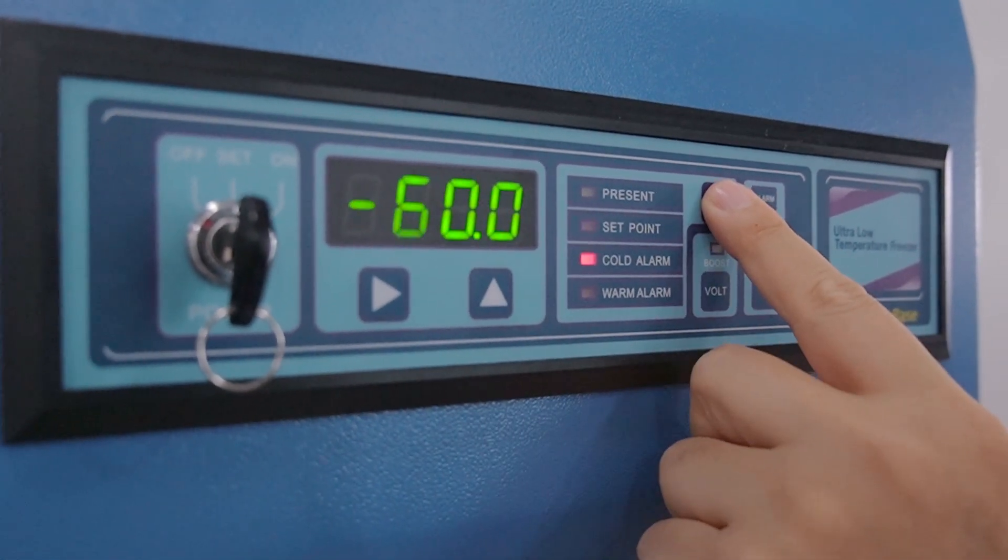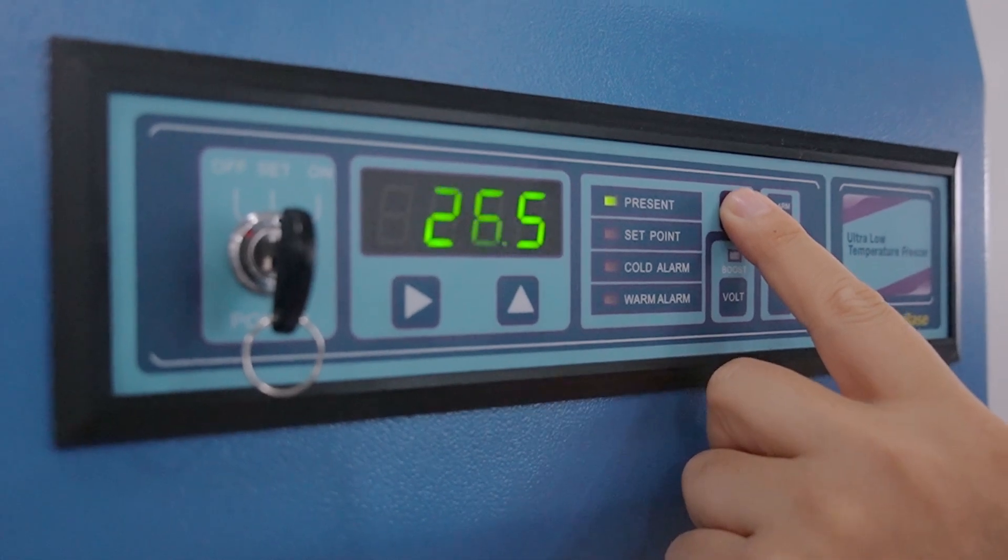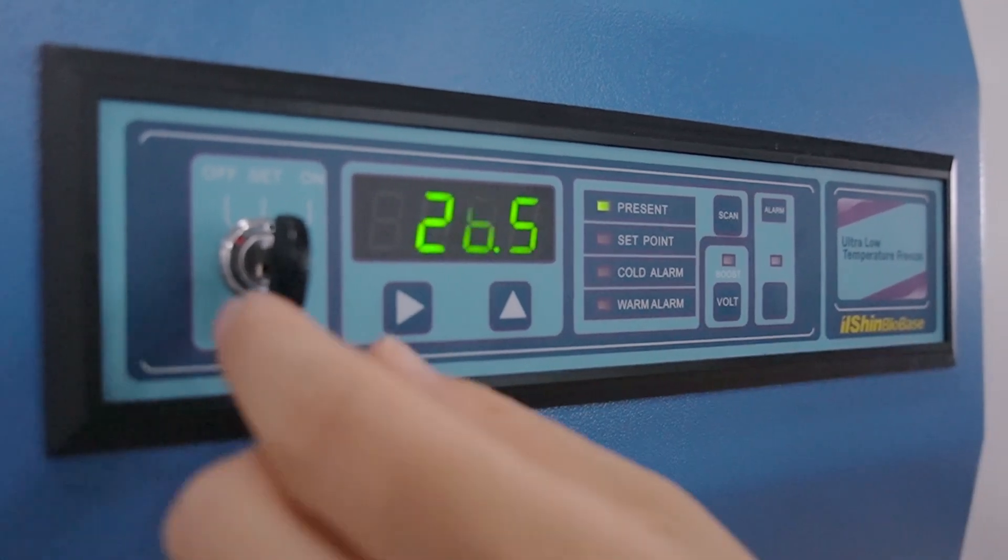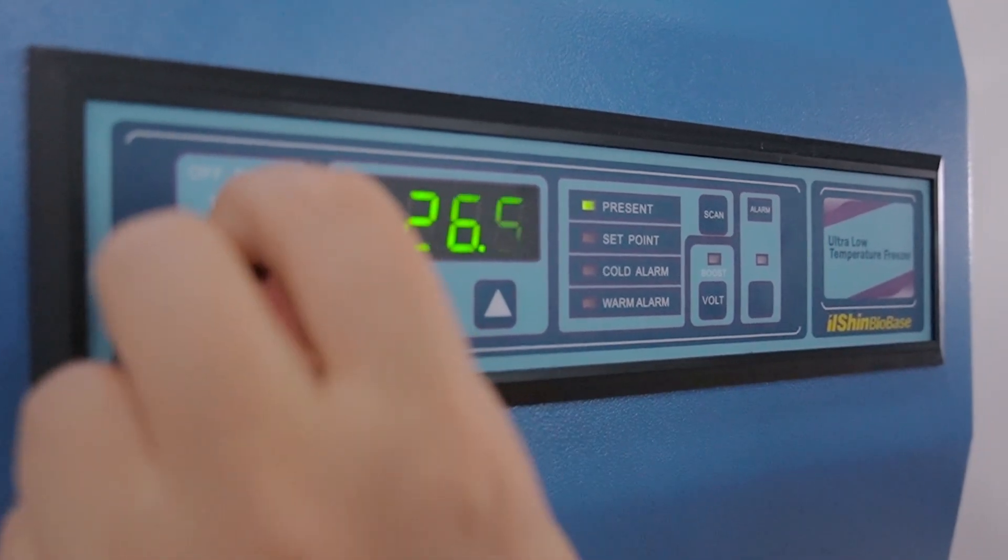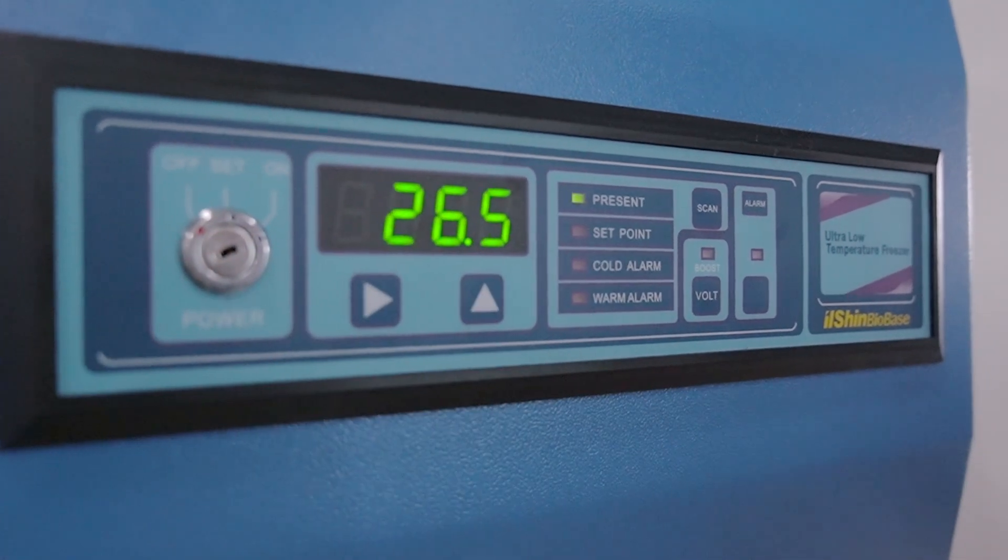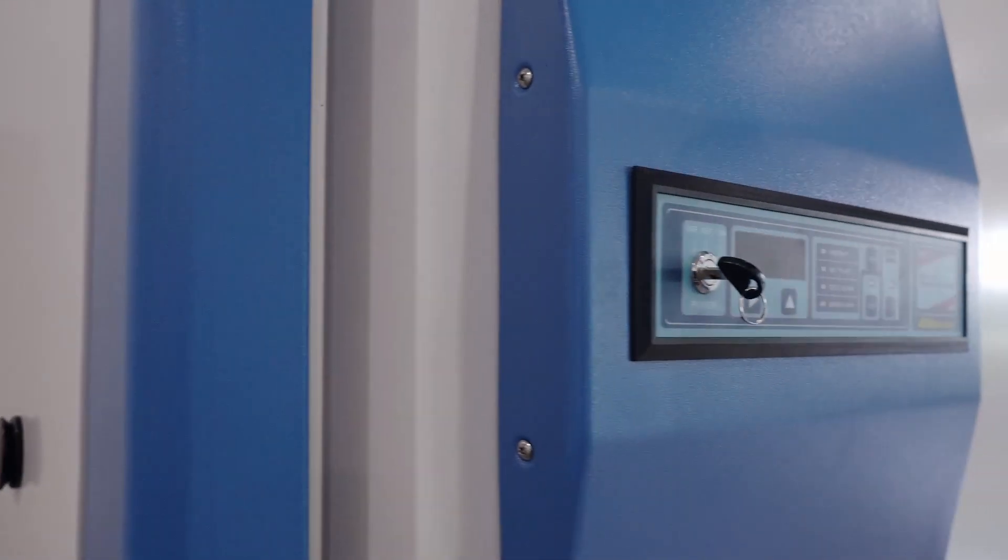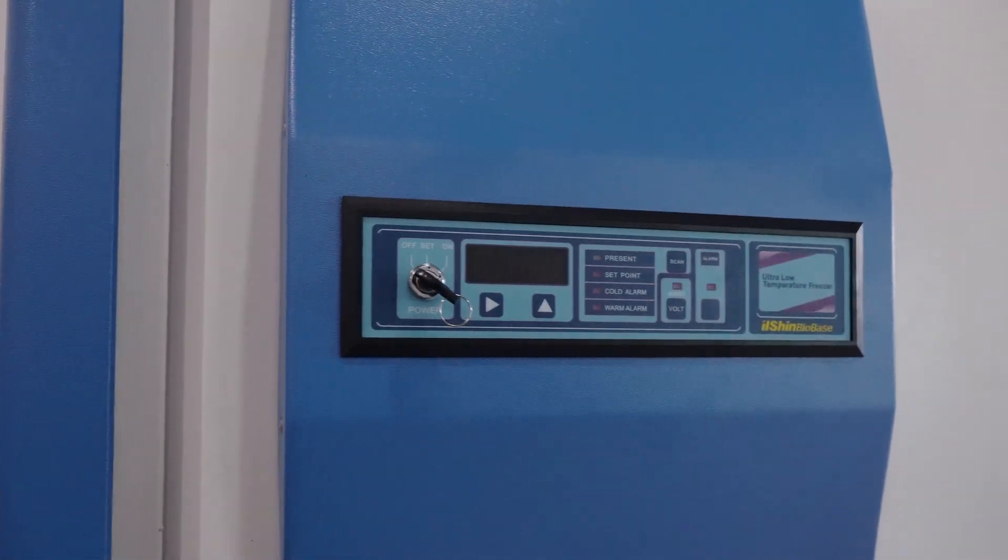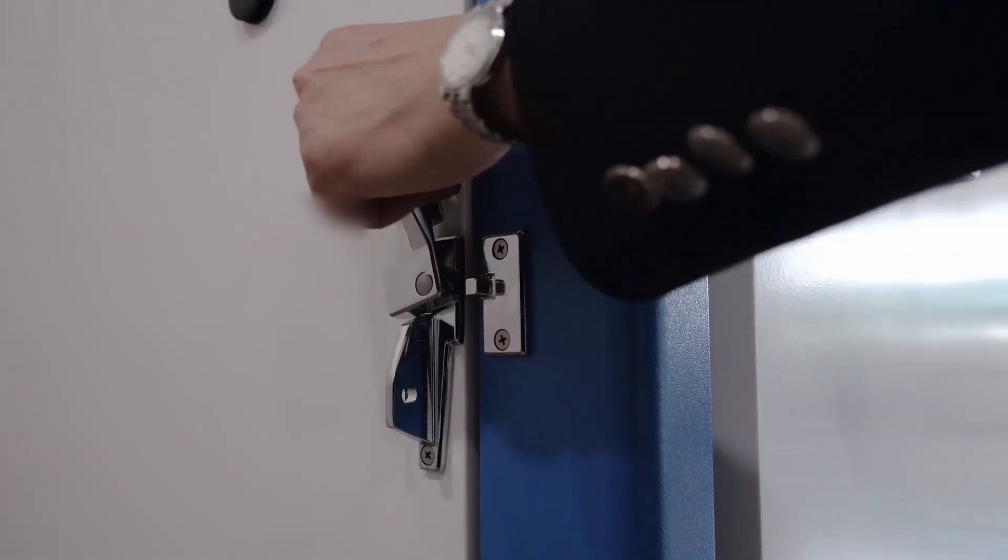After changing key position to on, no one else than key holder can change the setting. Now everything is ready and GP-Series Freezer is under your control.